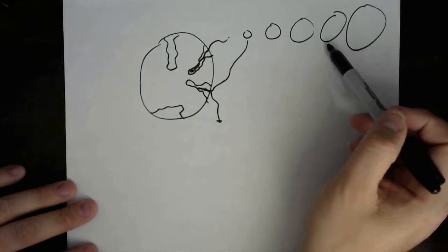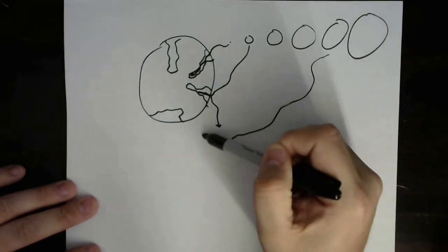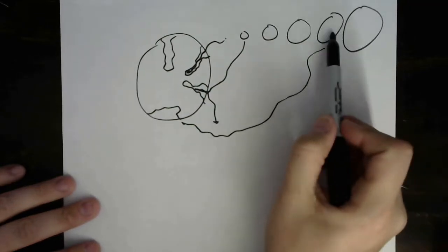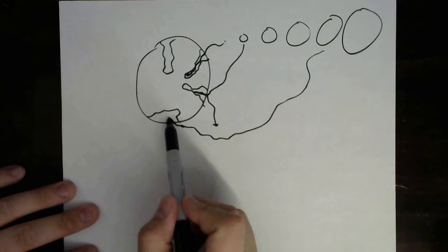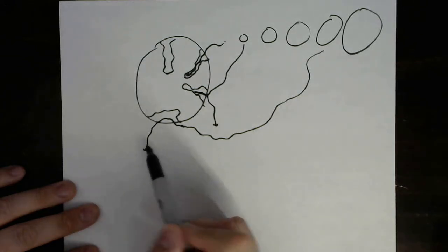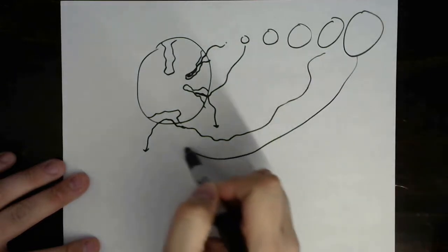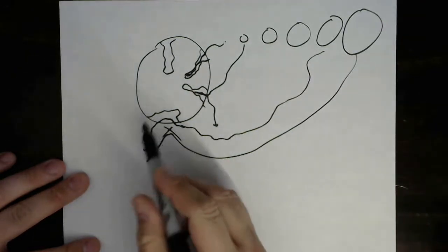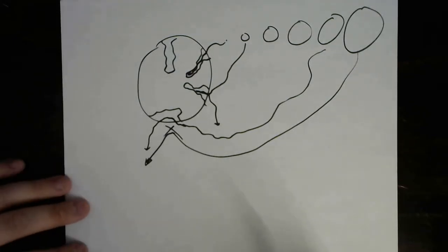And still, there's going to be other particles that are so large that they can barely get in. So, just the way I've drawn this, that's probably large enough to spend a little bit of time inside that particle. But this one for sure is too big, can't get in at all, right? So this thing spends no time in the stationary phase particle, all of its time in the mobile phase, moving past the stationary phase particles.